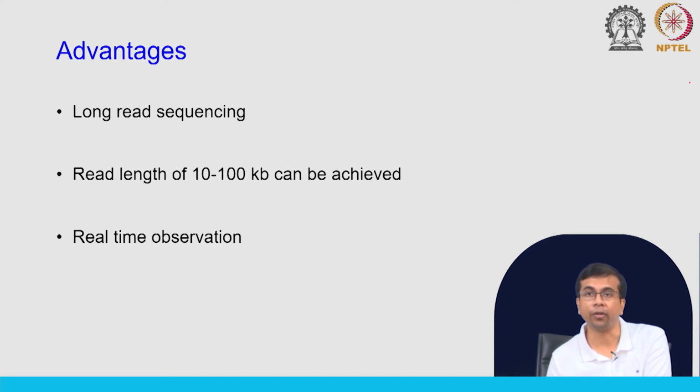In addition, this is also a single molecule sequencing, right. So, we are getting the signal from a single molecule. Like SMRT, we are sequencing one molecule, and each nanopore will get a unique DNA molecule. This is again really advantageous, because we can now identify the changes in the DNA molecule just beyond the bases. Okay. What if there is some other modification or some specific characteristics? Those can be identified because we are now observing these single molecules in real time.